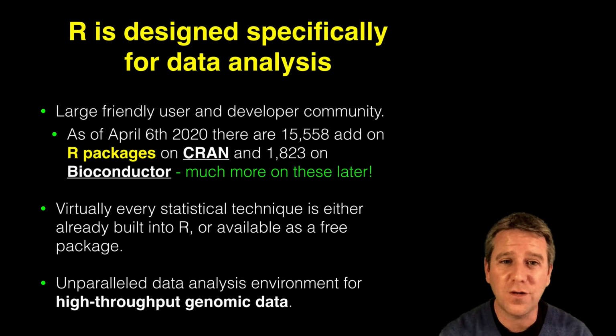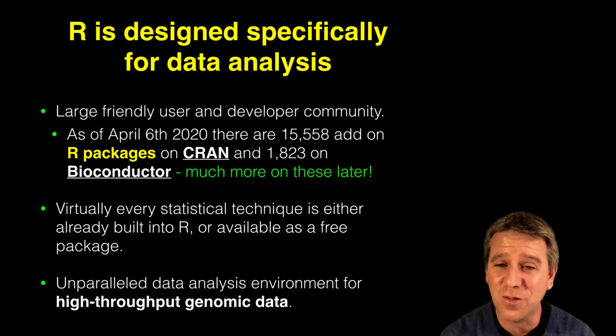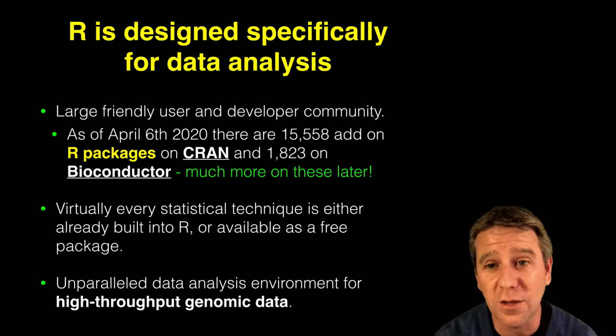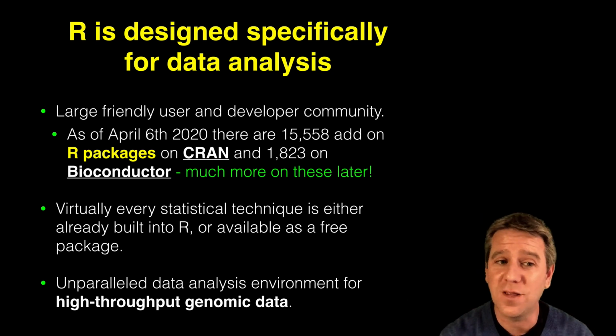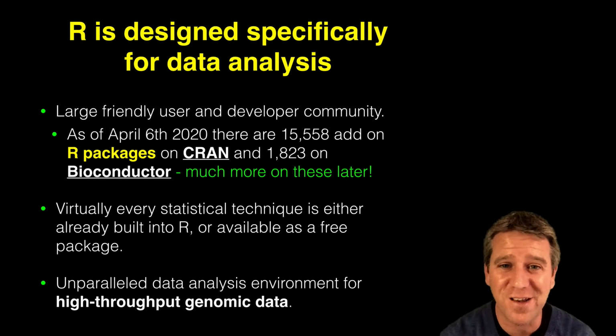It really offers this unparalleled environment for exploring your data, for sucking on it and seeing what it tastes like, both to indicate what's good about it, but also potential problems there might be, what you might need to revisit. For genomic data, it's an unparalleled data analysis environment for high throughput genomic data, as we'll see throughout the rest of this course. Actually, that's where we're going in these next segments.